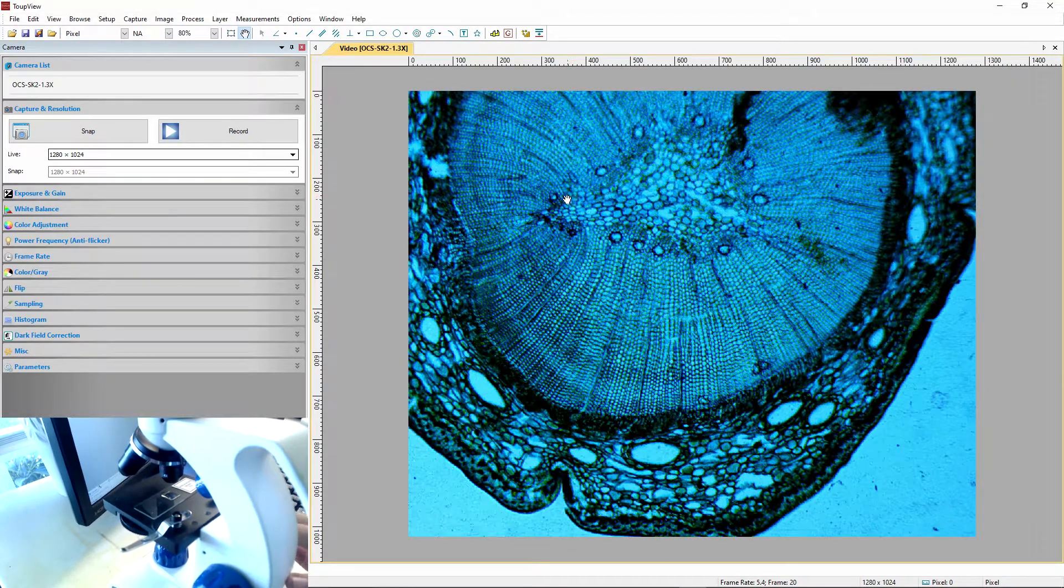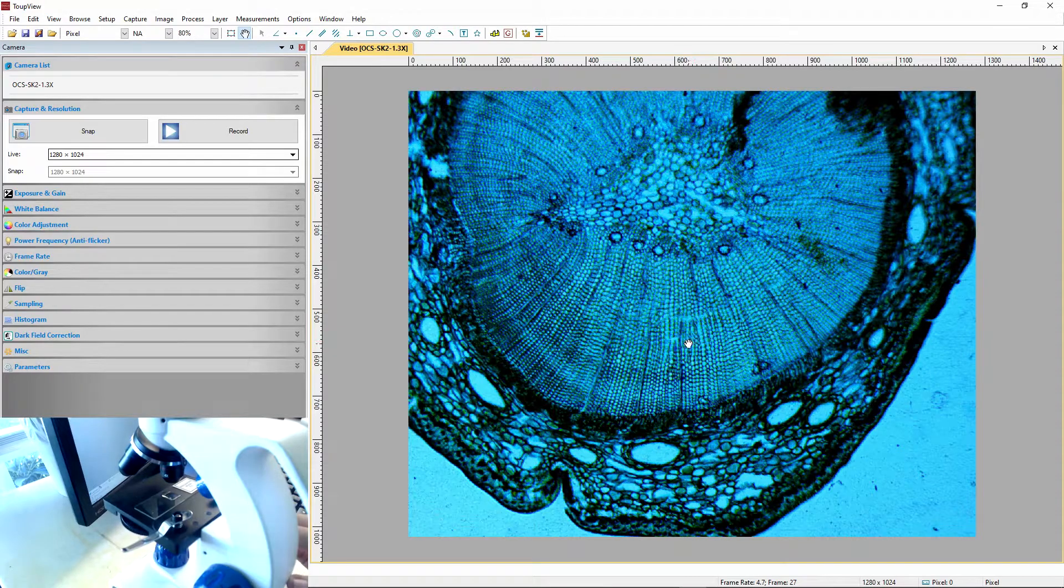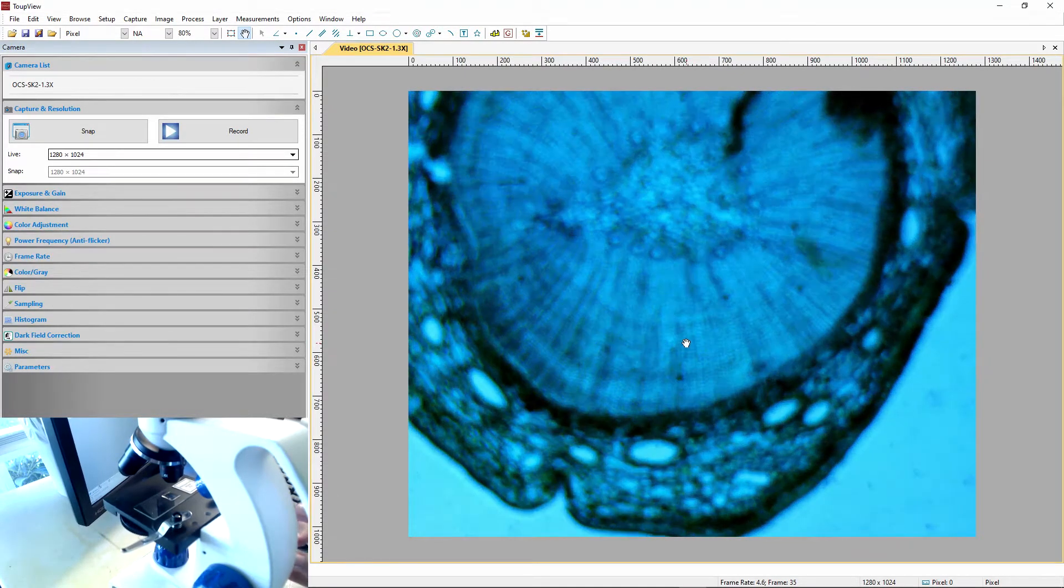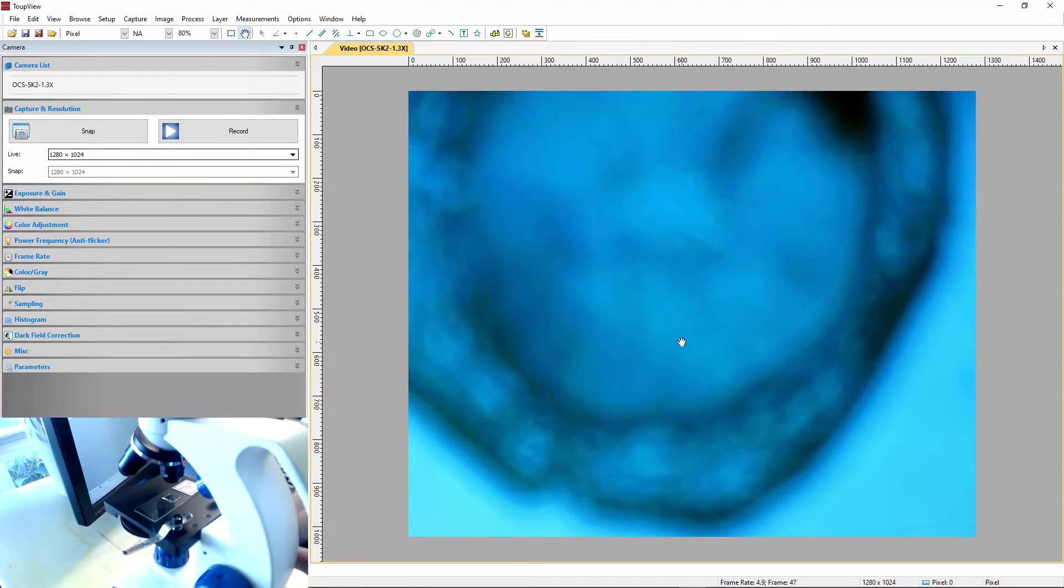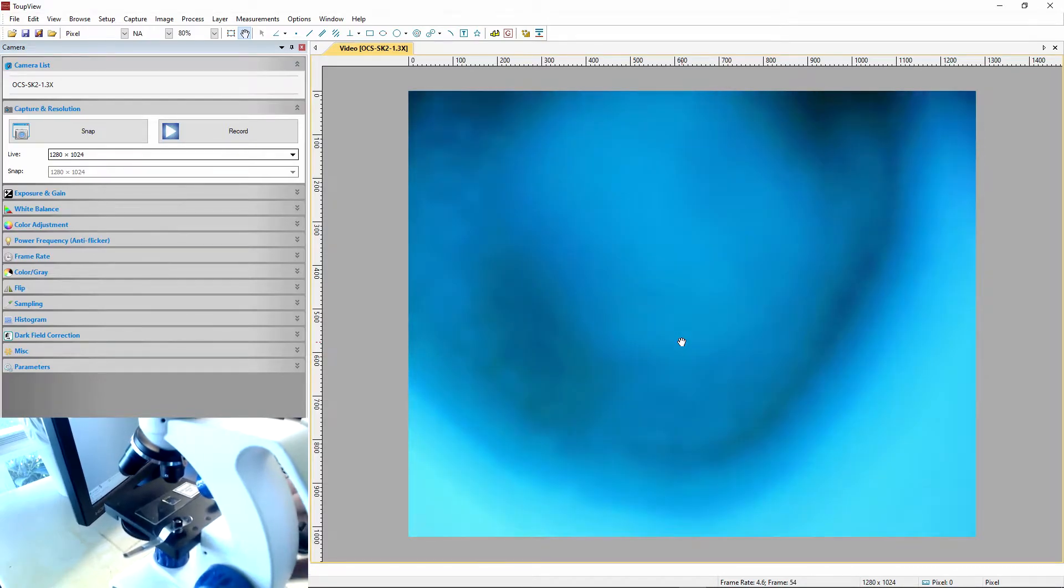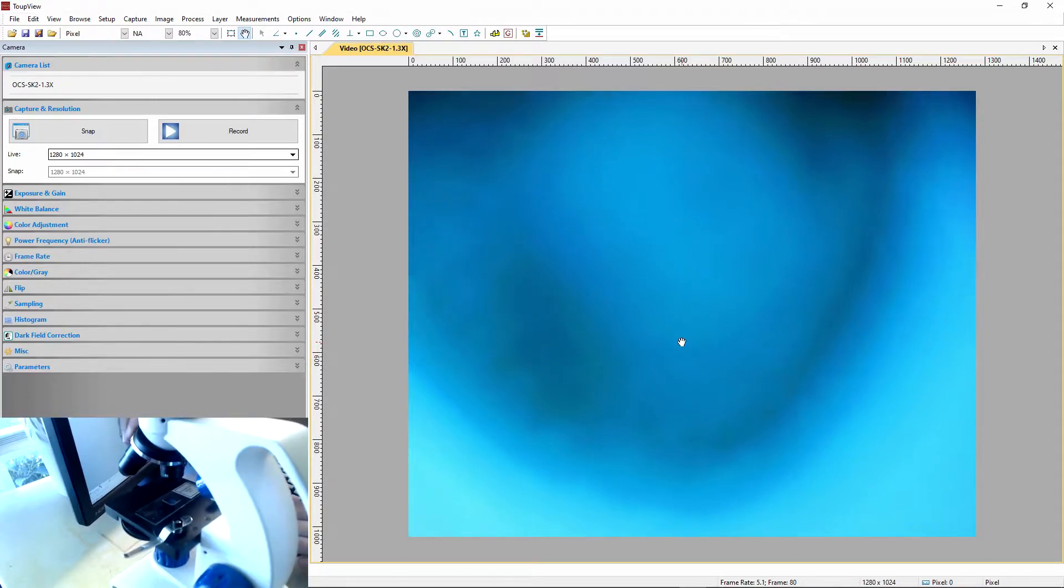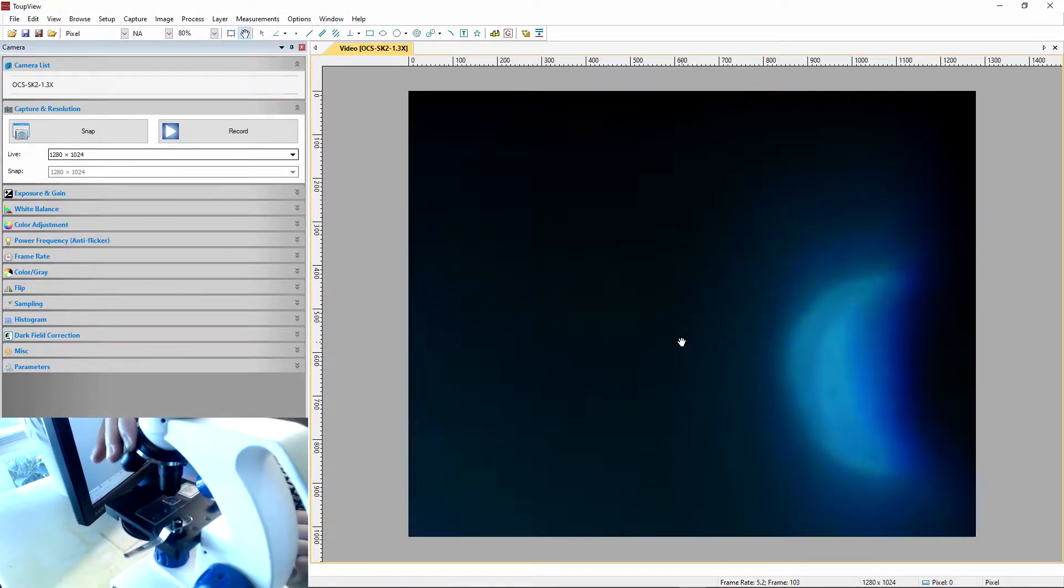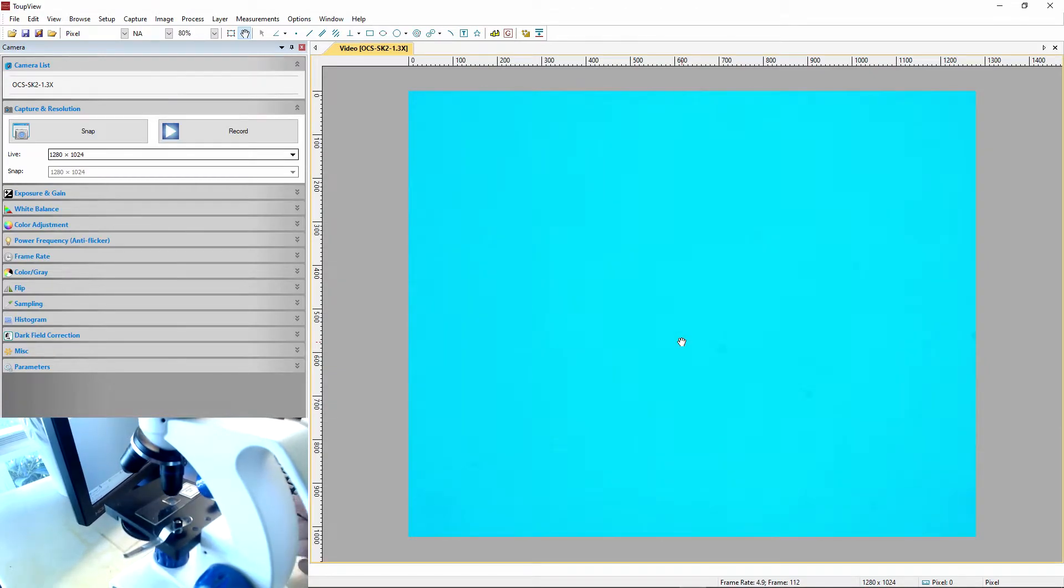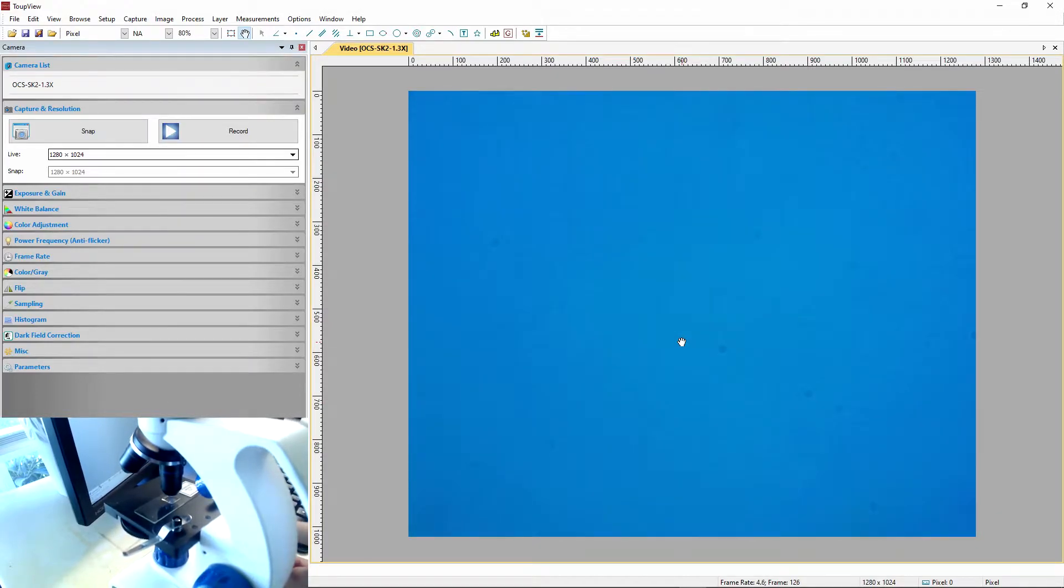Maybe we need to zoom in a little bit more. At least we know it's in focus. I'm going to go to really detail here. So, this is, that was magnified four times. This should be magnified, I think, a lot of times. Or, no, that was 40 times magnification. This is a lot of times magnification.